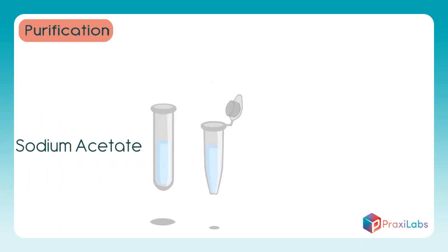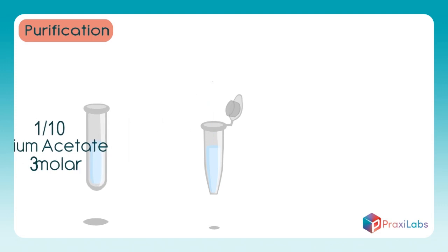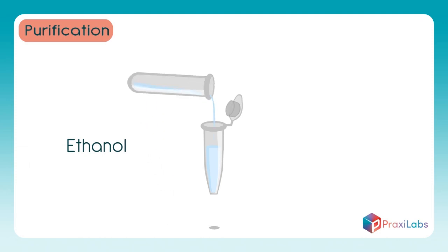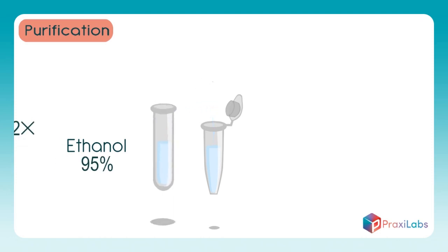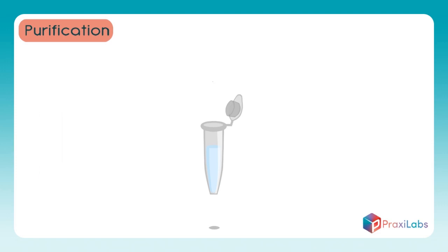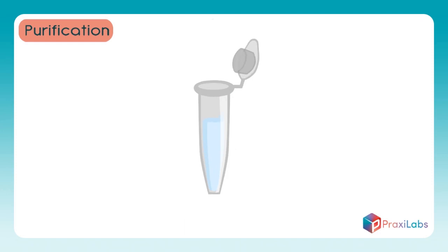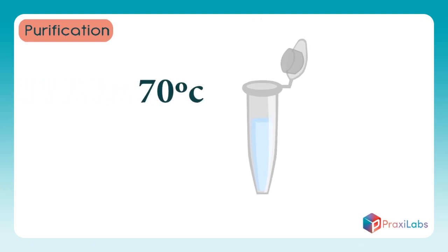Add a solution of sodium acetate with a concentration of 3 molar, one tenth the volume of the sample, to the sample. Add an ethanol solution with a concentration of 95%, double the volume of the sample, to the sample. Mix the contents of the tube by inverting it, then leave it to precipitate at a temperature of negative 70 degrees centigrade for a whole day.